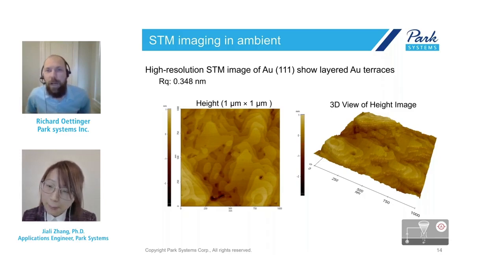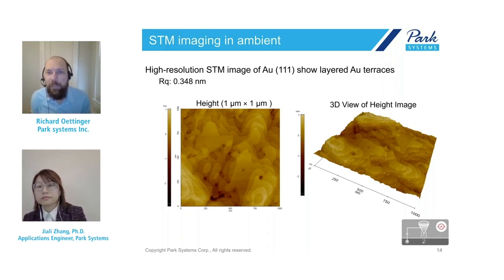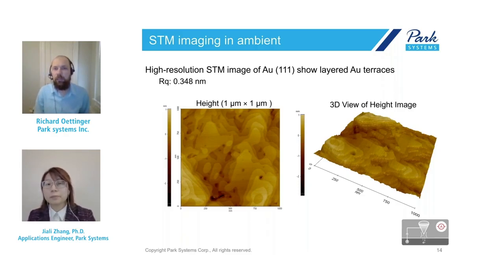All right. Why is it possible to image varying topography of cells in liquid mode using PinPoint but not tapping? For PinPoint mode, it's completely different from tapping. I think you think PinPoint is similar to non-contact, but it's different.